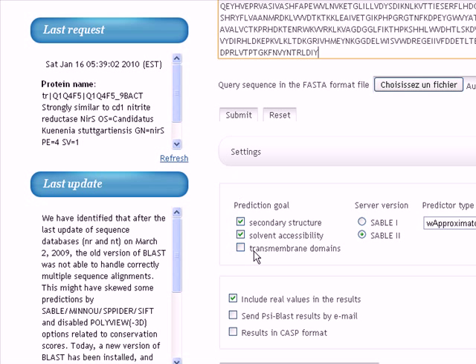You can select transmembrane domains to predict the transmembrane helices, and in this tutorial I'm going to stick with the secondary structure.